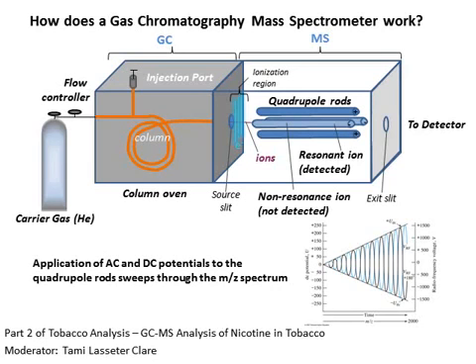The ions that do not have the correct mass-to-charge ratio to make it through the quadrupoles crash into one of the rods and are annihilated and therefore not detected. The ones that get through at any given point in time have a very small range of mass-to-charge ratio. And depending on the magnitude of the AC and DC potentials being applied, the selection of ions that are able to get through varies with time, and so we can build up a mass spectrum from the series of snapshots to plot the relative intensity of ions versus mass-to-charge ratio.